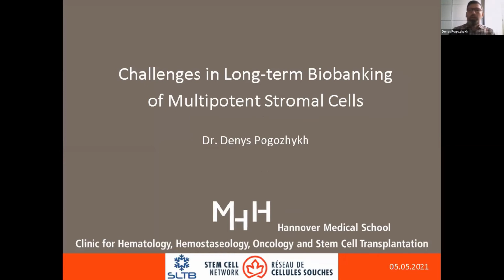So it was really great and very important talks today about a lot of very important practical aspects of cryobiology and cryopreservation, basic principles, and also preservation of different cells. I will go more specific on what we have particular experience with, and we will also talk about challenges of practical biobanking of multipotent stromal cells, which is also related to current perspectives in clinical application of multipotent stromal cells and stem cells in general.